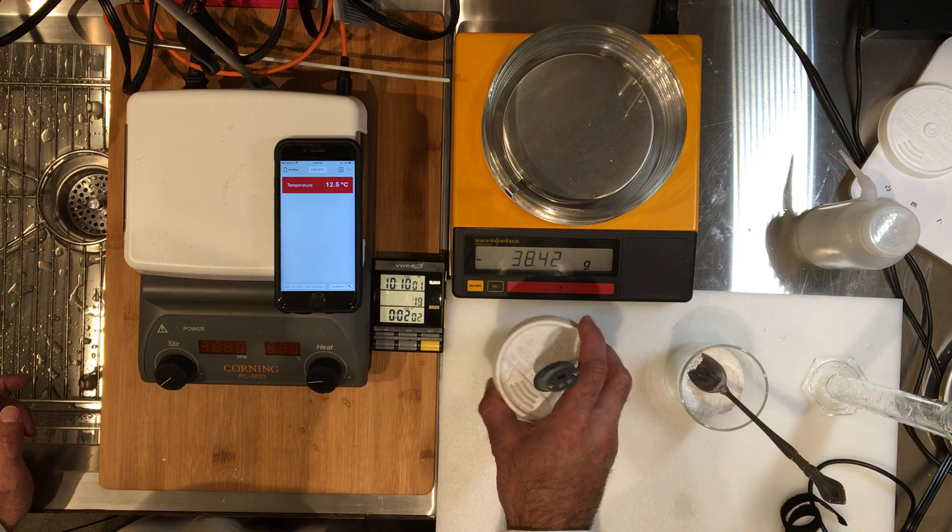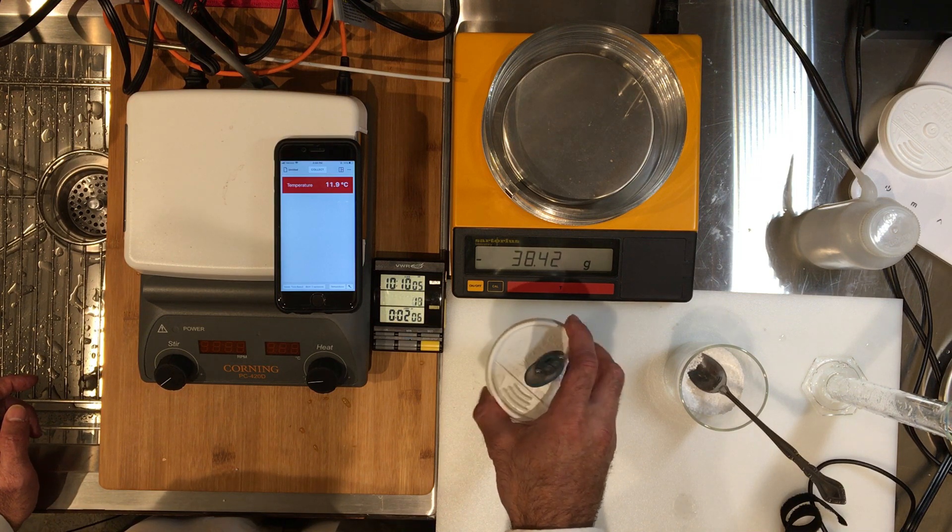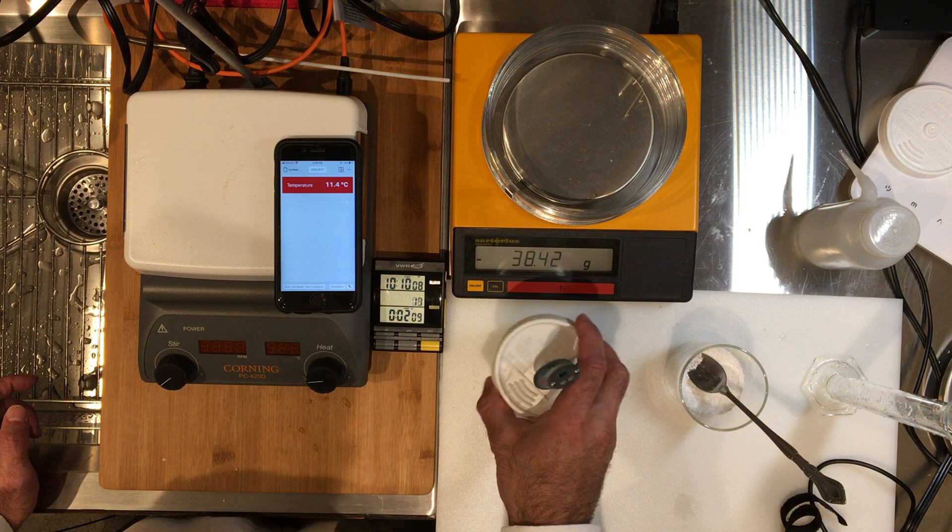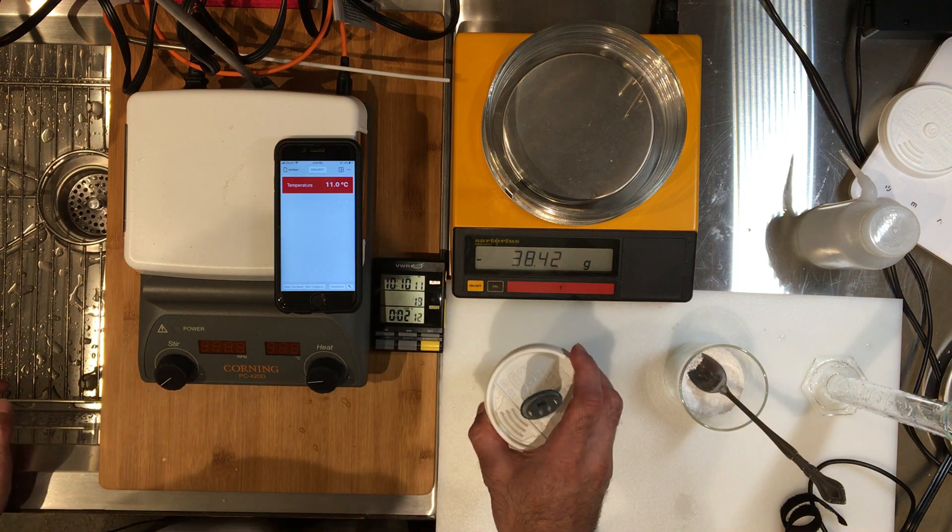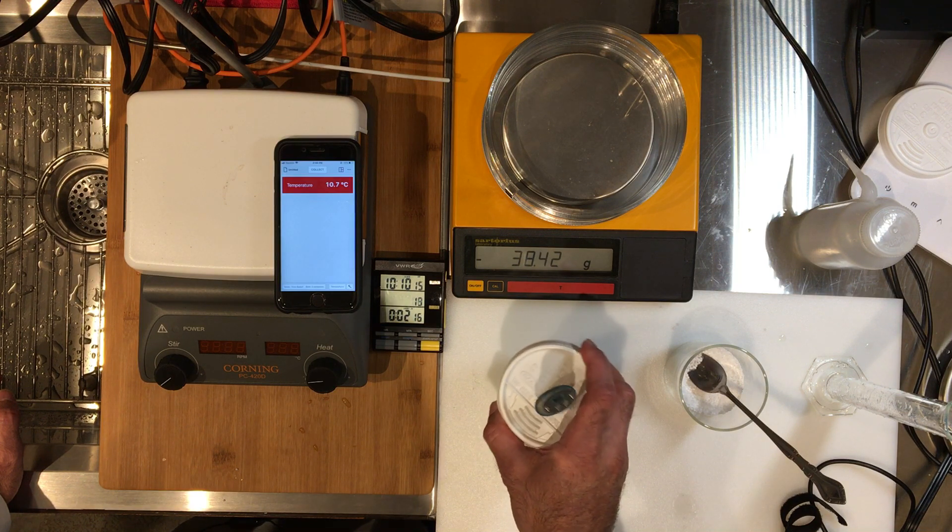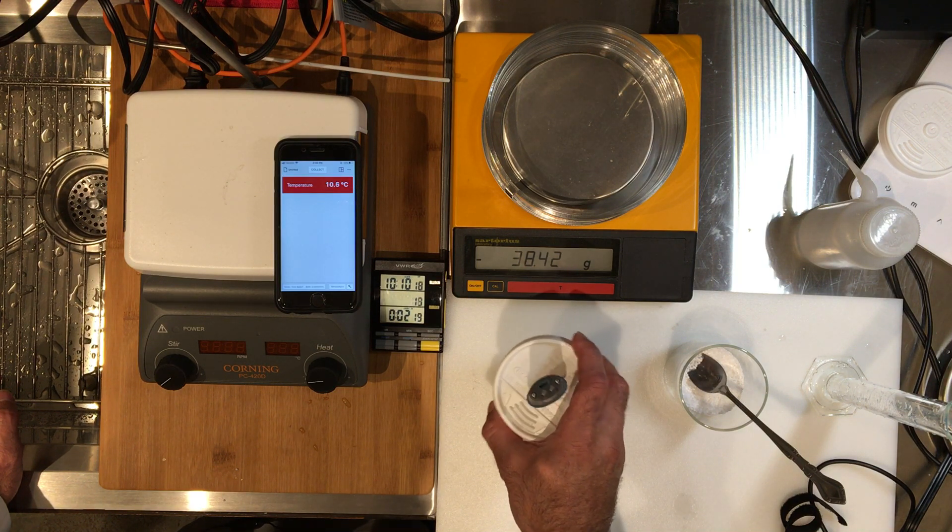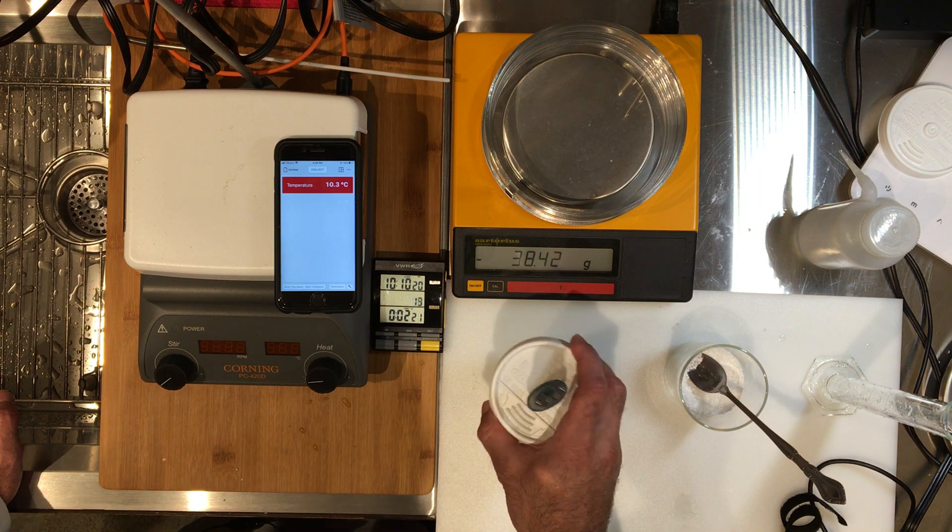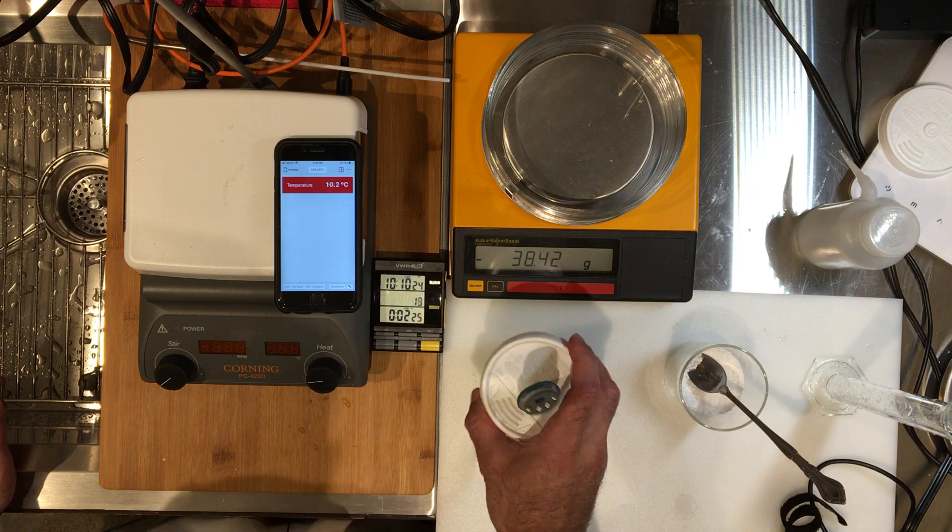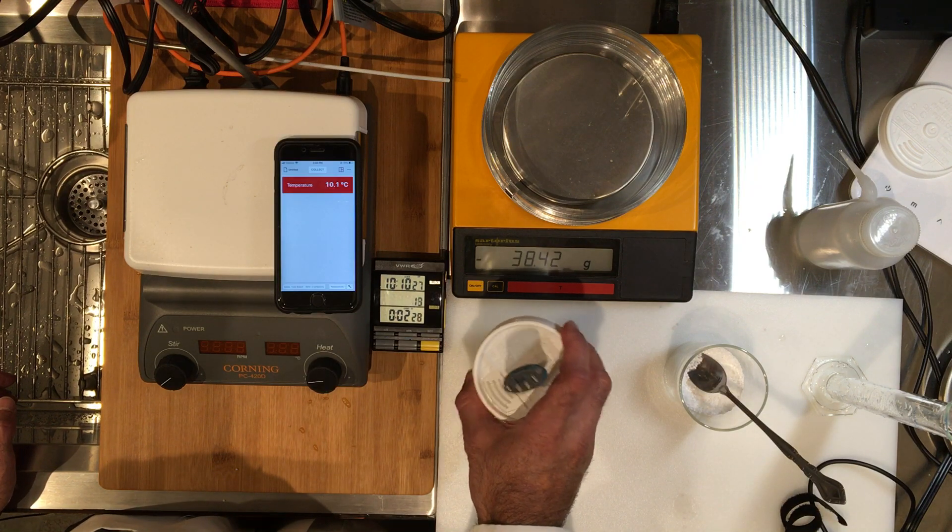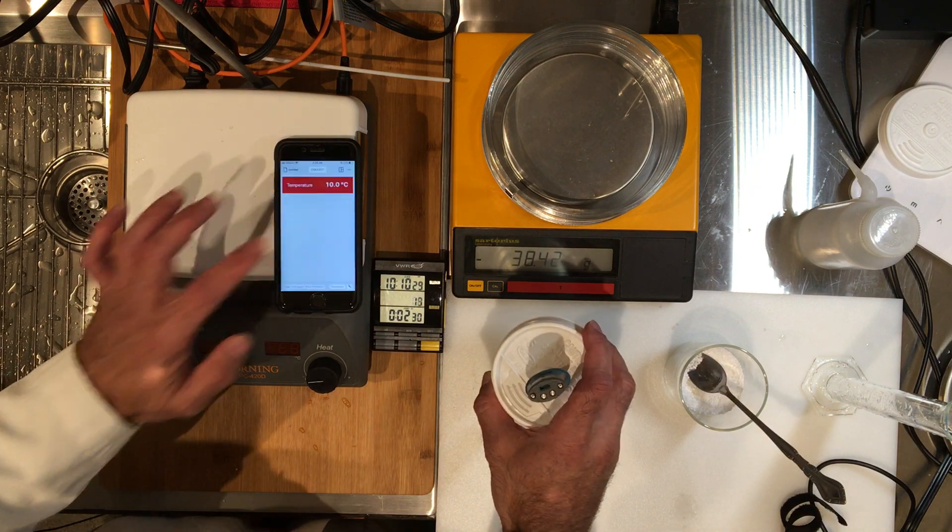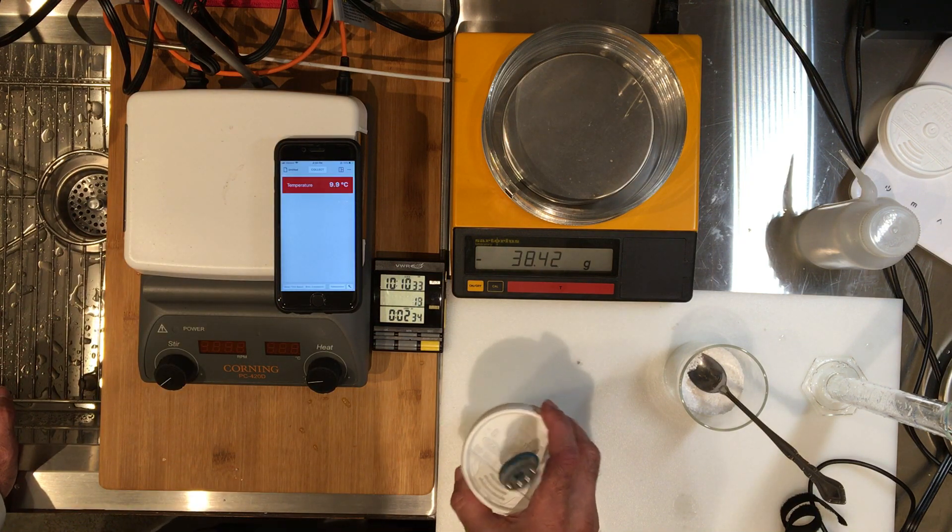The temperature is really dropping. It's a cold pack. Reaction is happening. The idea is to let it go down to the lowest temperature. When it starts to climb back up, we can actually stop it at that point. But it's still going down.